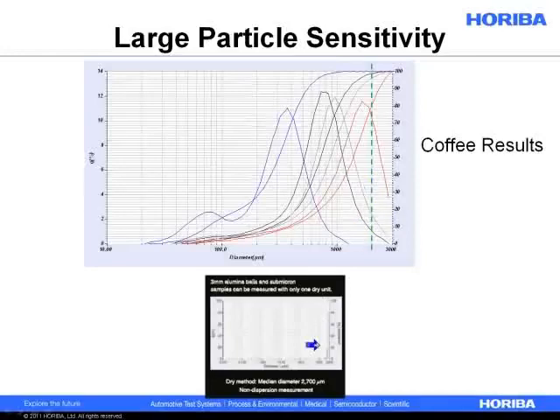Here in the bottom graph, I think these are 3 millimeter alumina balls. So we do have customers that measure at the extremes of the distribution. And depending on how the sample's set up, this could really only be suitable for diffraction. When you get into the large area, it could be more suitable for other techniques. This is capable of being sieved. It's also capable of being analyzed using image analysis, but many times it's still diffraction only.